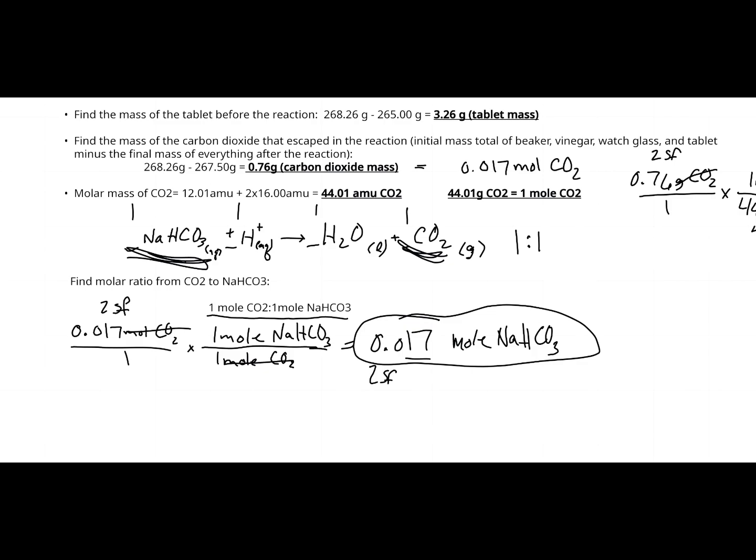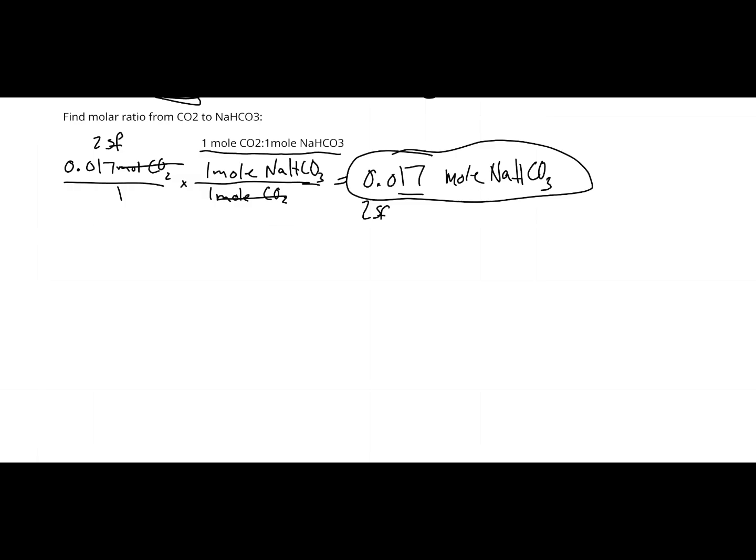So again, we're going to have to convert these moles of sodium bicarbonate back to grams of sodium bicarbonate, okay? I'm going to go ahead and just stretch this bar out here so that you can see what I'm doing now. So what I want to do now is I need to find out the molar mass of sodium bicarbonate.